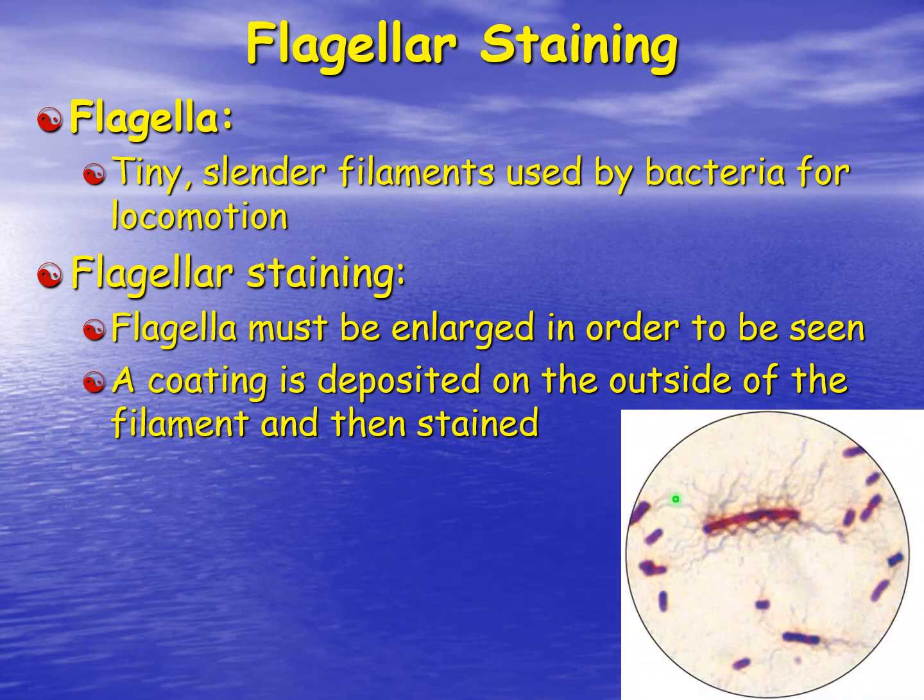And so here's our living organism, the elongated rod here. And then you can see these kind of tiny little hair-like structures coming off, and these are the flagella. And so this is a flagellar stain.